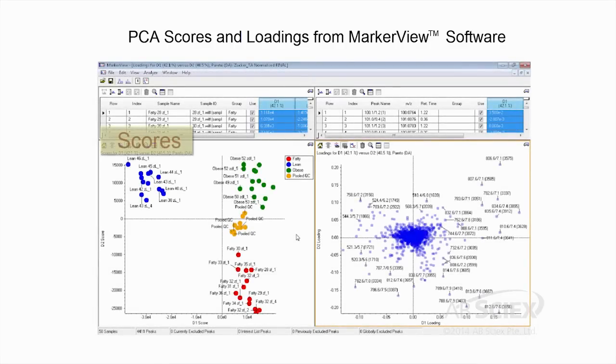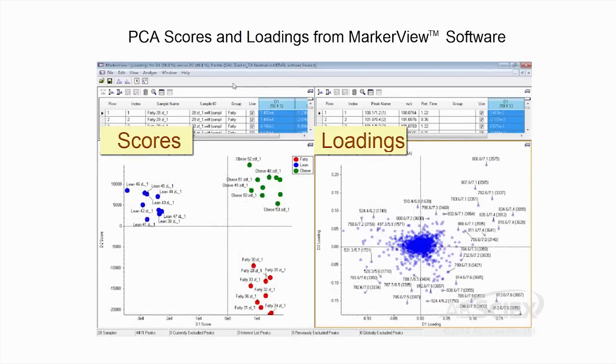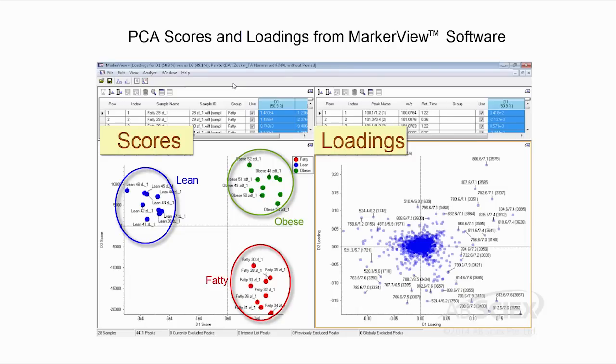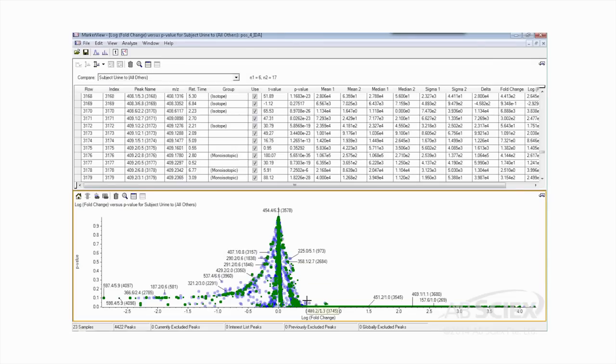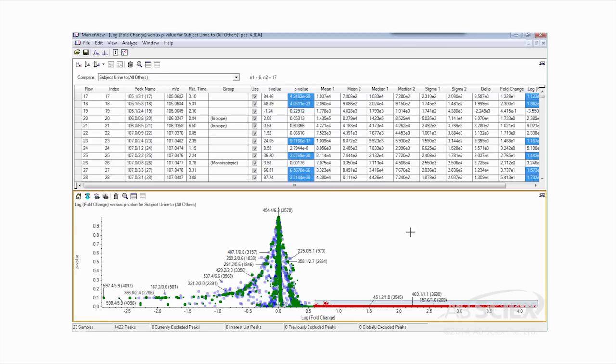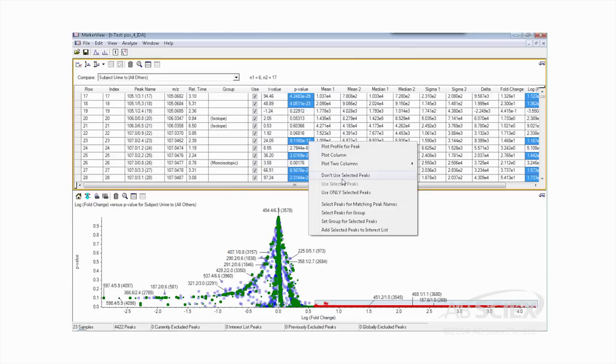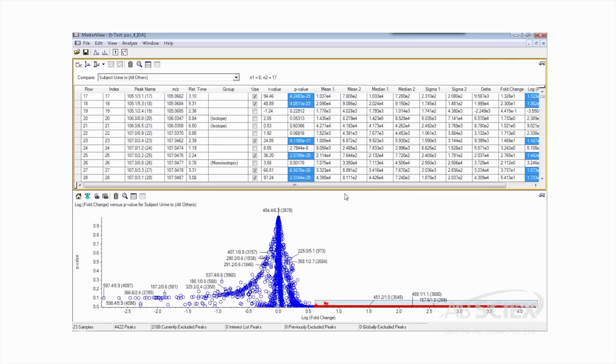MarkerView software compares different groups of samples within a study and quickly determines if there are any differential features amongst the groups by multivariate statistical means. Here we show an example of a Zucker rat model to study the effects of obesity, diabetes, and cardiovascular diseases. Principal component analysis, t-tests, and principal component variable grouping are among the tools one can quickly use to generate features and peak lists of interest in MarkerView.